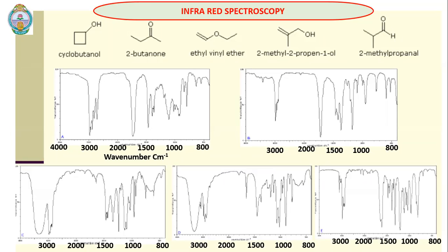But as I said earlier, it is not possible to completely identify the structure. If you are given the molecular formula, or the molecular structures, and you are given spectra and asked to identify them, it is possible. But without any of these data, with simple spectra, we cannot completely identify the molecule. Okay, right.